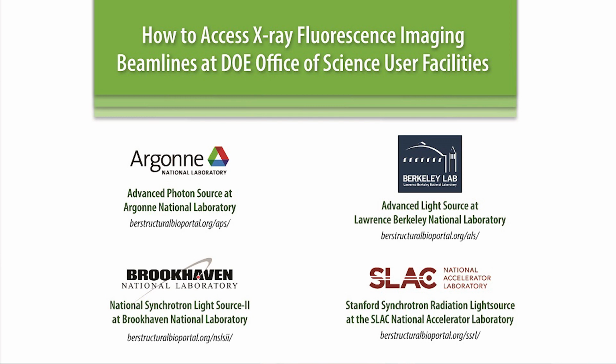XRF imaging is also available at a number of other user facilities, information on which can be found on the BER Structural Bio Portal website.